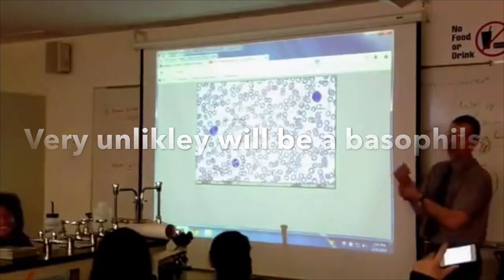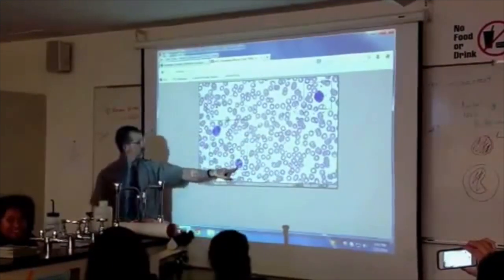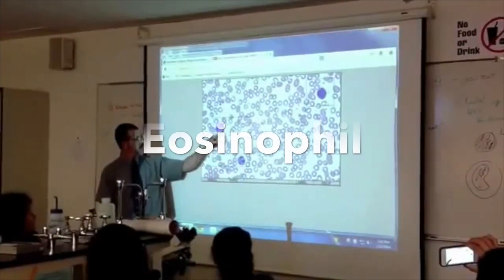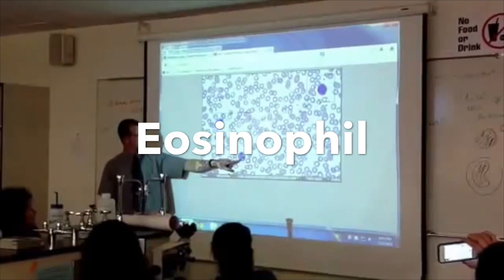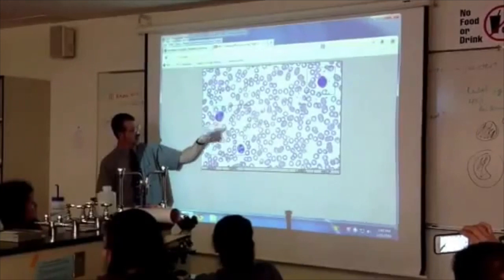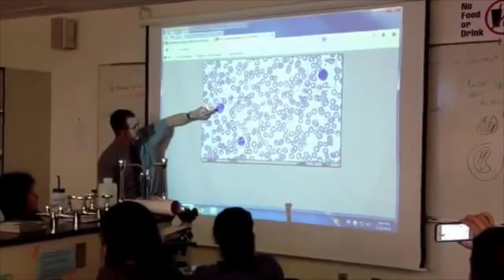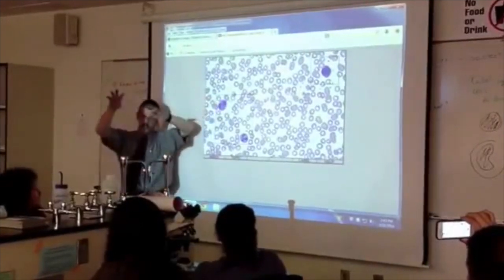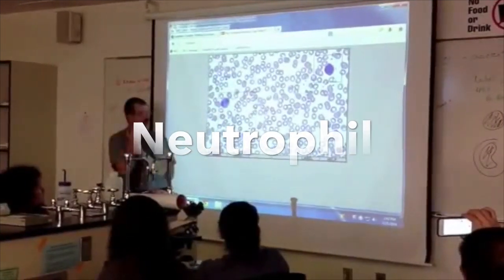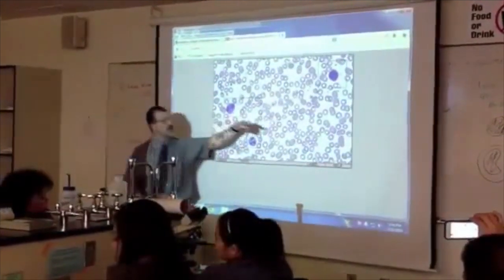So go for it. That one is a neutrophil, but it looks oddly like an eosinophil, the other one. This one? Is it because the nucleus isn't attached that it's not? No, the other one. This one? Yeah. It's more granular. You can see there are more speckles in this one. And the nucleus, it's hard to see because of the speckles, but it makes kind of 2 lobes shifted. A neutrophil usually has about 3, kind of like a clover leaf. Oh, so that is an eosinophil. Yes, it is. Oh, okay. That is what I would have figured. This is an eosinophil. Okay.